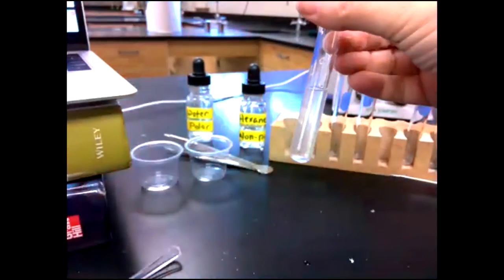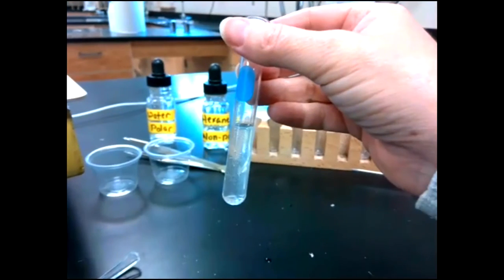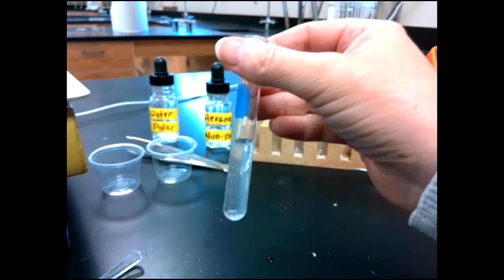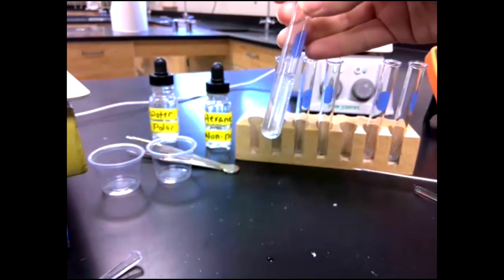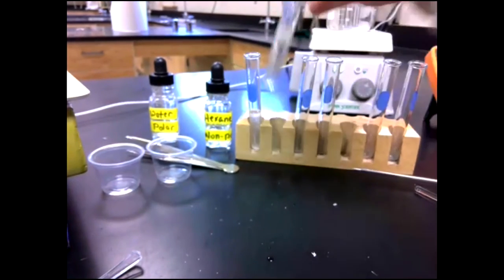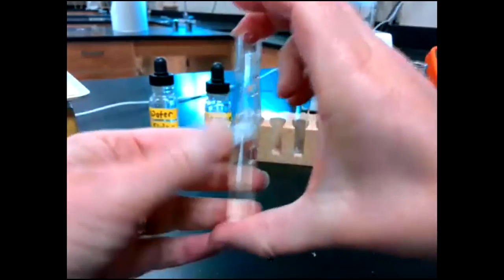Okay, and for us, solubility is actually a gradient. You can measure specific solubility, but we are going to call it yes or no. Yes, it dissolves. No, it doesn't. So that's a yes. So A dissolves in water. And this is B, also in water. You'll notice that it floats, so you might want to make a note of that.